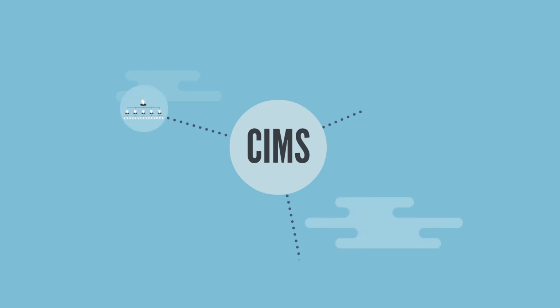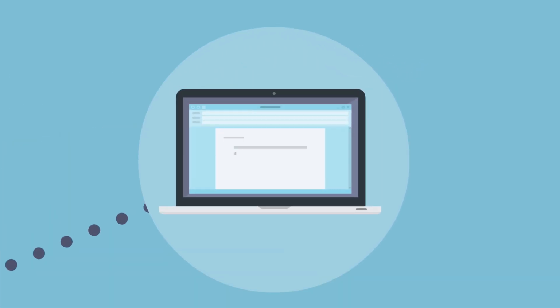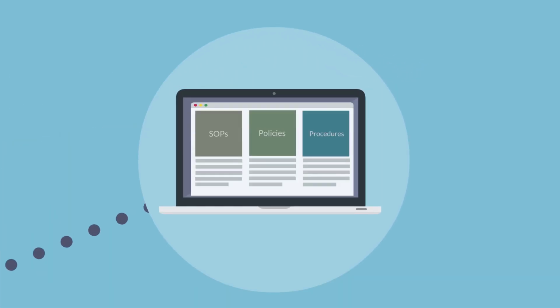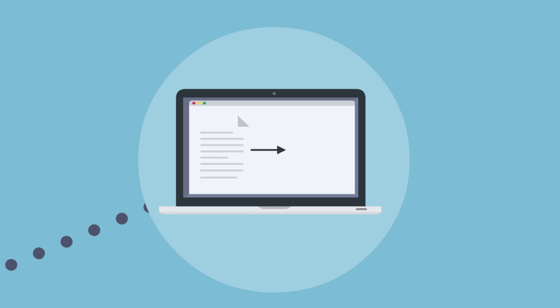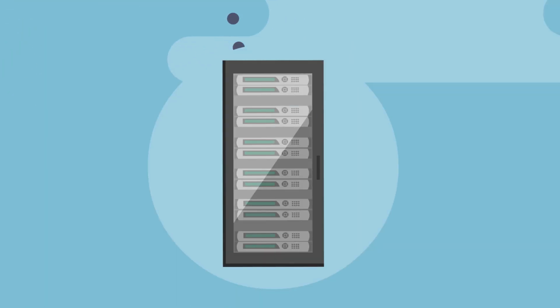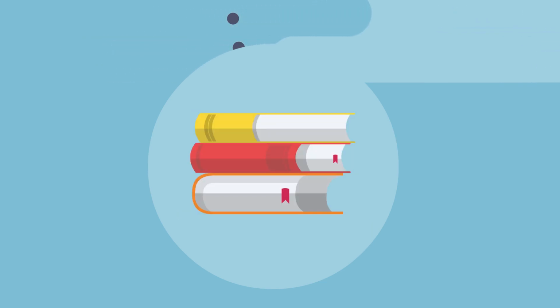There are three important components to a chemical inventory management system. First is a method for documentation and record keeping, which includes all standard operating procedures, or SOPs, and the inventory database. SOPs contain the core documentation for policies and procedures and how the chemical inventory is tracked, audited, and managed. Databases, which can be an effective tool for tracking chemical inventory, come with different technical and security challenges. However, what matters most is that the database is suited to serve the needs of the facility or institution efficiently.